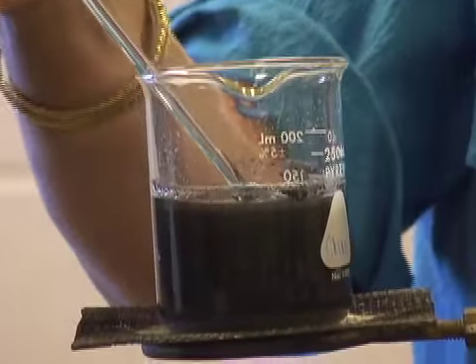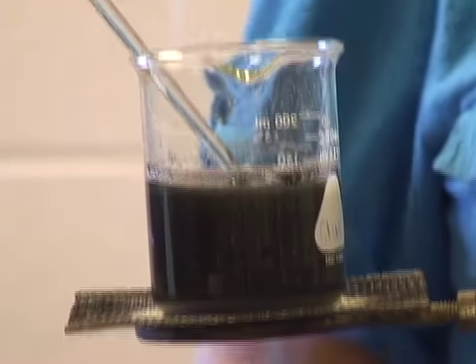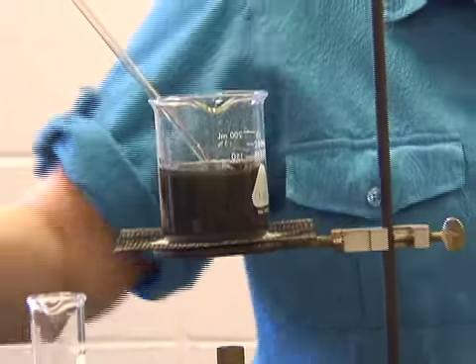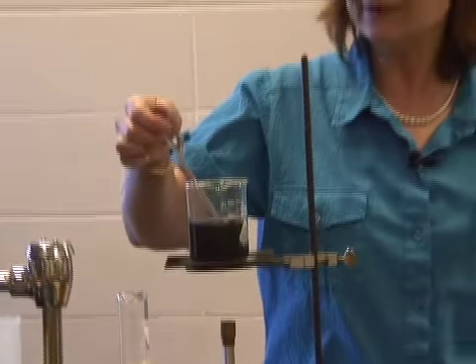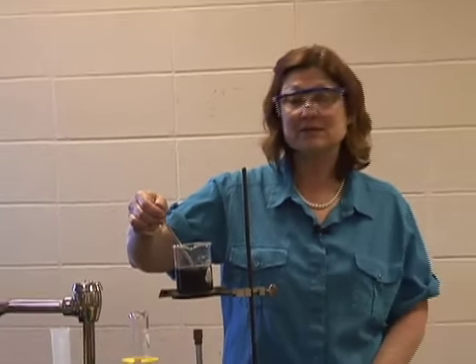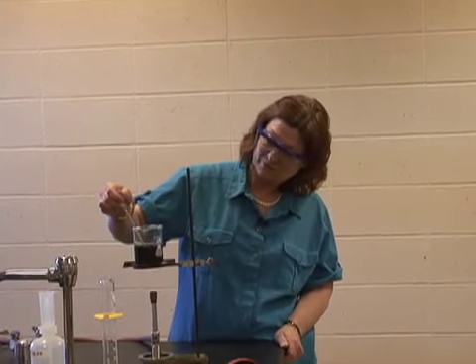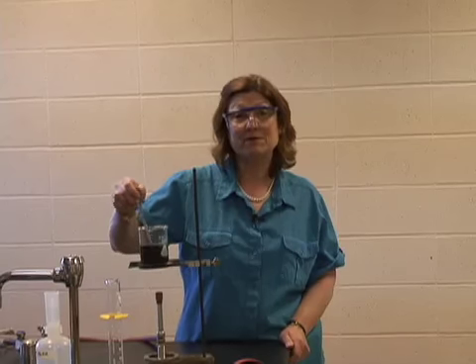This is as far as we can get for today. I'm going to go ahead and turn off this Bunsen burner, and I'm going to put this aside and have it wait for us for tomorrow. You can see that, oh my, we got some bubbles going on down there, and we must be cautious with that.